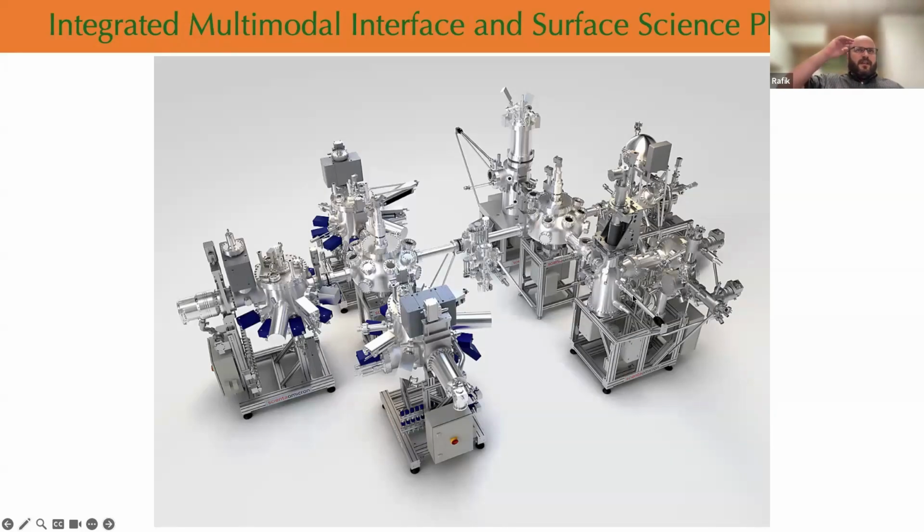But this is just, if you really want to investigate or answer a fundamental question, you really need to have this combination of complementary techniques, like microscopy, spectroscopy, and also diffraction.